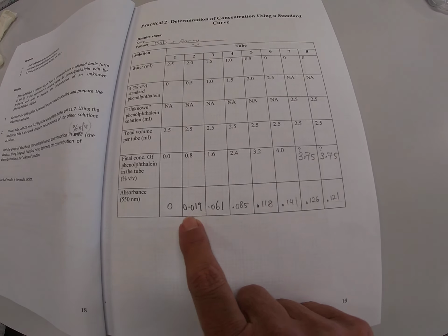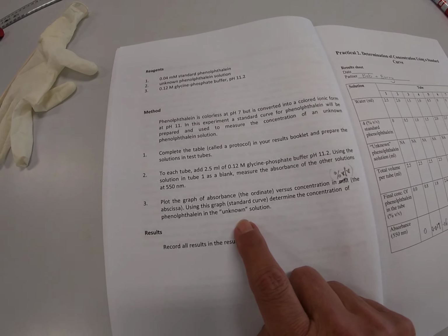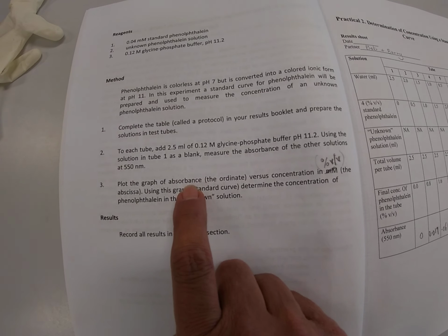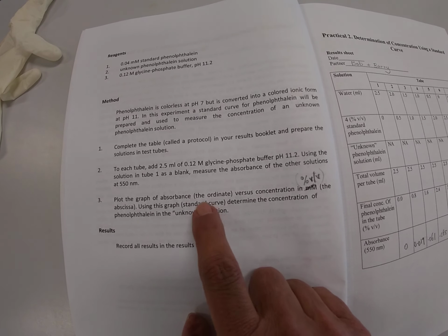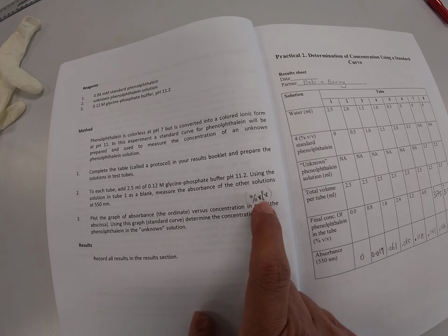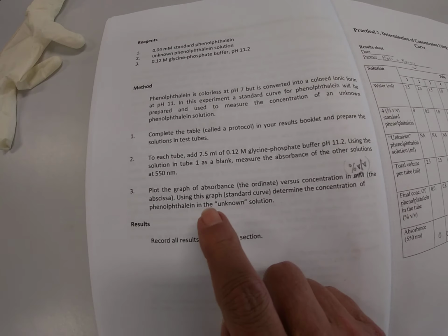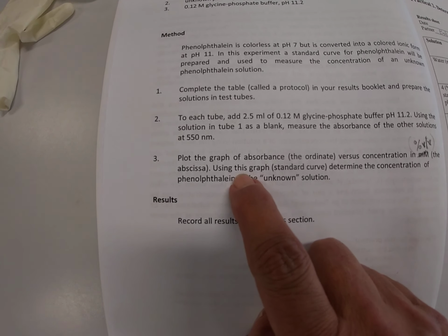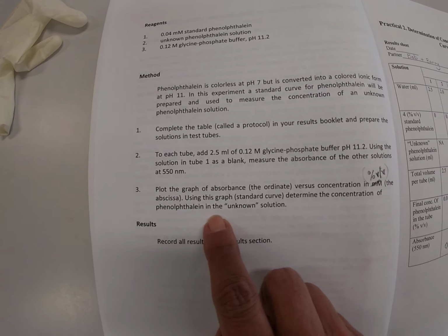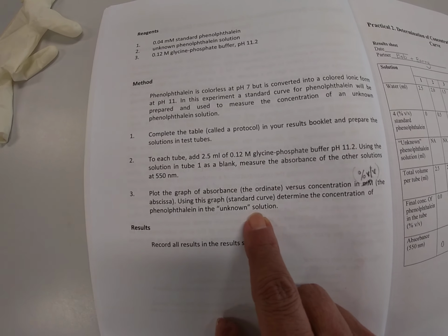Now that we have all our results in the table here, we can move on to step number 3 in the methods. That is, we can plot a graph of absorbance on the y-axis, also known as the ordinate, versus concentration in percent volume per volume on the x-axis. Using this graph, which is known as a standard curve, we can determine the concentration of phenolphthalein in our unknown solution, that is in tubes 7 and 8.